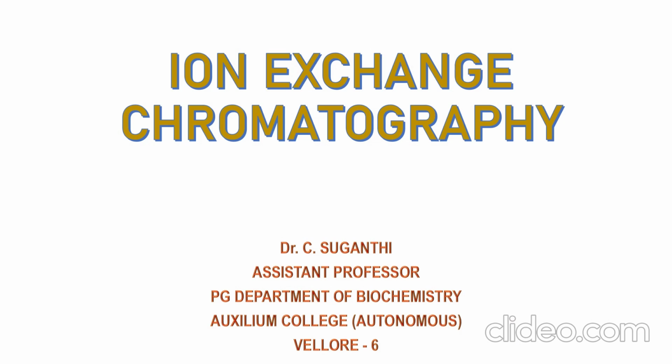Hello viewers, today in this video we are going to discuss ion exchange chromatography. Before diving into the topic, let us first understand what is chromatography.